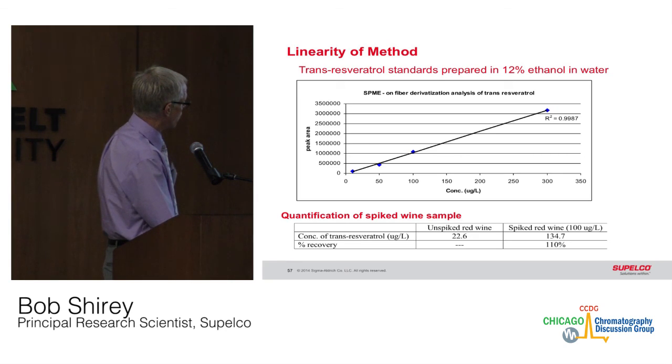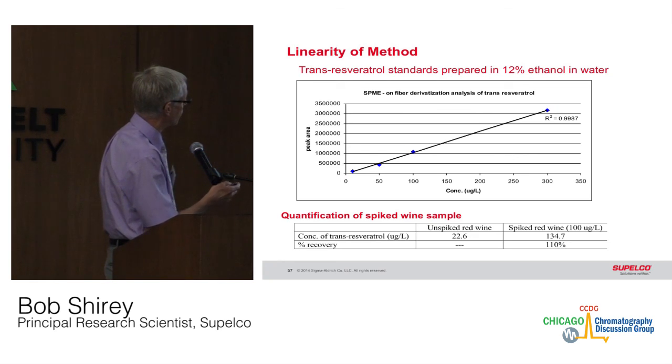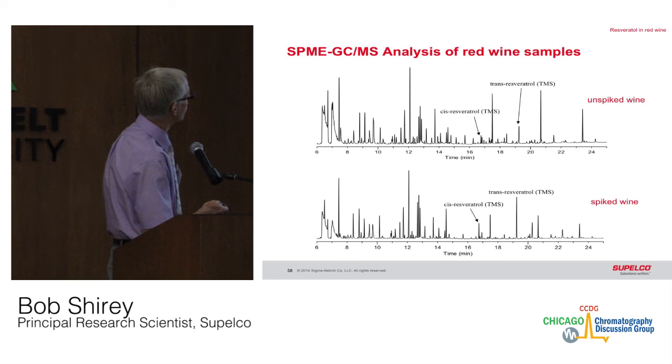We looked at the trans of unspiked red wine, came out with about 22, and the recovery of the spiked amount of 100 micrograms came out about 134. With the 22 that was in there to begin with, that's pretty close to what you should be, and we probably had a little bit of background that was contributing to it. You can see the 2 slides here of the spiked and unspiked.